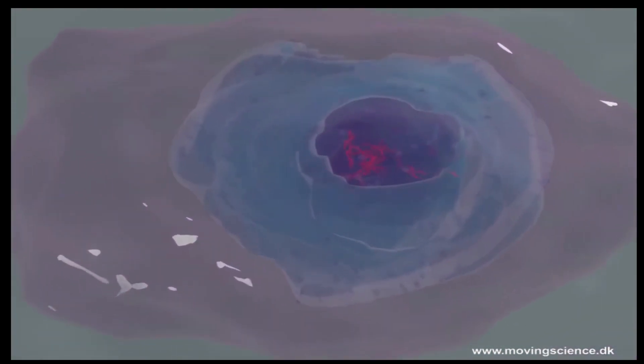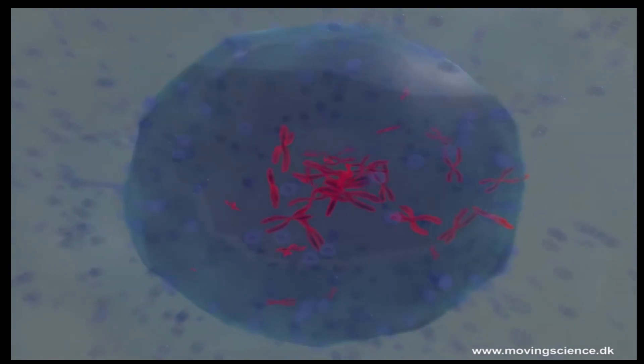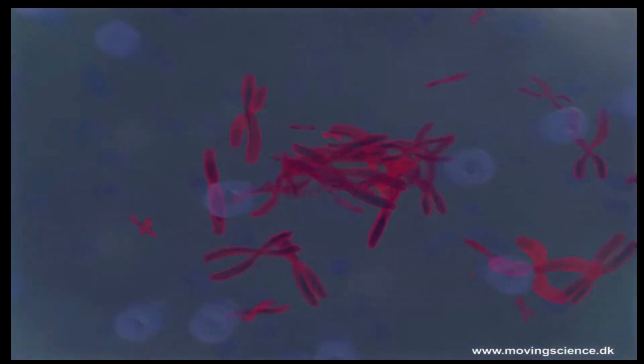A DNA reading starts with a plastic tube with your spit. In your spit there are cells with your DNA. The spit is processed, so there is only DNA left. This is called DNA extraction.